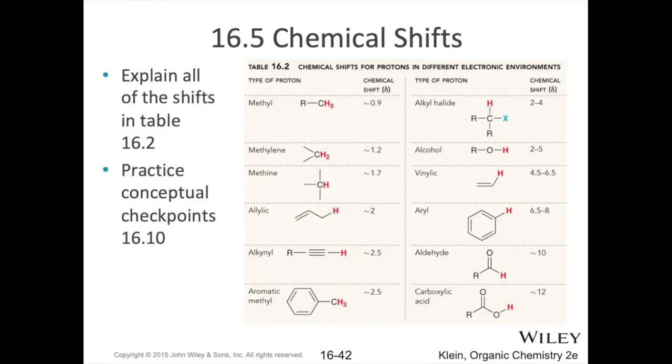Okay. Earlier I mentioned you can find tables of functional groups and get a feel for roughly where various types of protons will show up. Reference tables like these are great when you're trying to read and interpret NMR spectra in general. For a quiz or exam, though, I do recommend getting a feel for some of the more common chemical shifts. Definitely use the example I gave you for the difference between methyl, methylene, and methine protons, and think about how they get shifted further downfield.